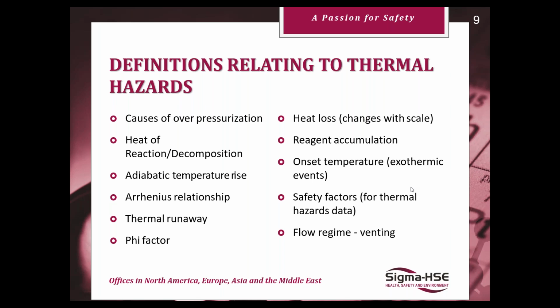The adiabatic temperature rise helps us describe how energy is retained within a system when we're translating from a small scale reaction to a material or reaction in bulk. The Arrhenius relationship is linked to how, as temperature rises, the rate of reaction is also going to increase. So we get an exponential relationship.